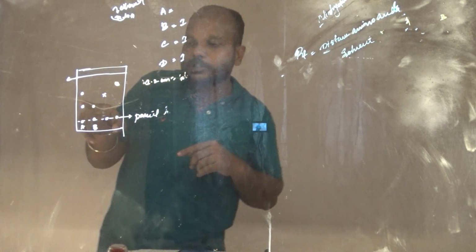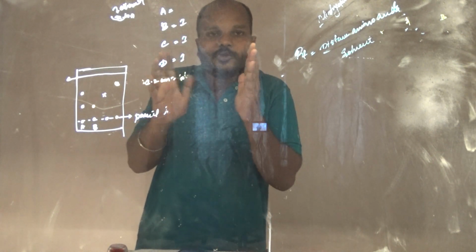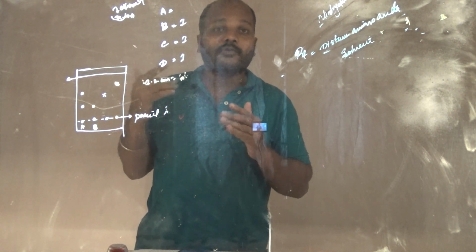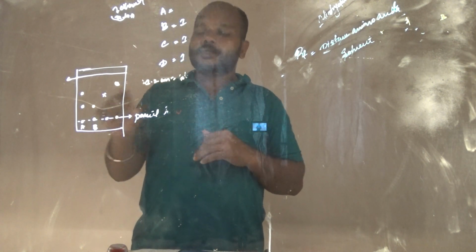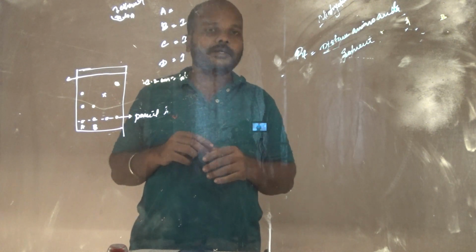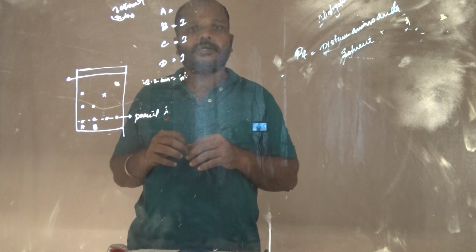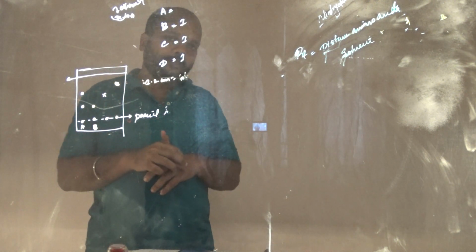In fact, this paper, as I already mentioned, is stationary, right? It is not moving, so it is the stationary phase. The solvent is moving, and we call it the mobile phase. The paper we are using is the stationary phase. In fact, not paper: if we are speaking holistically, it is nothing but cellulose. Cellulose is the stationary phase, and this solvent is the mobile phase.